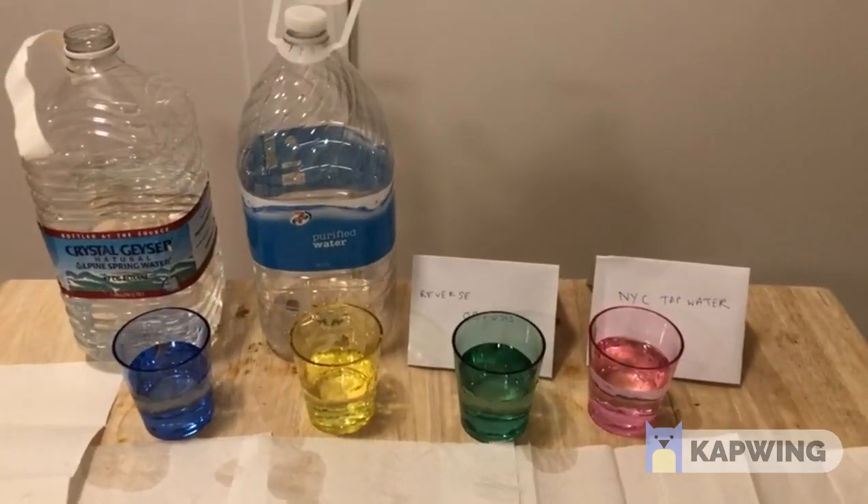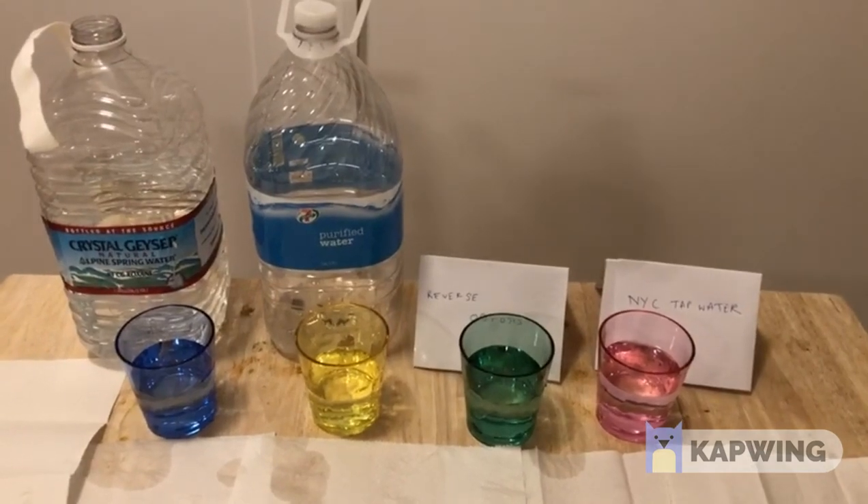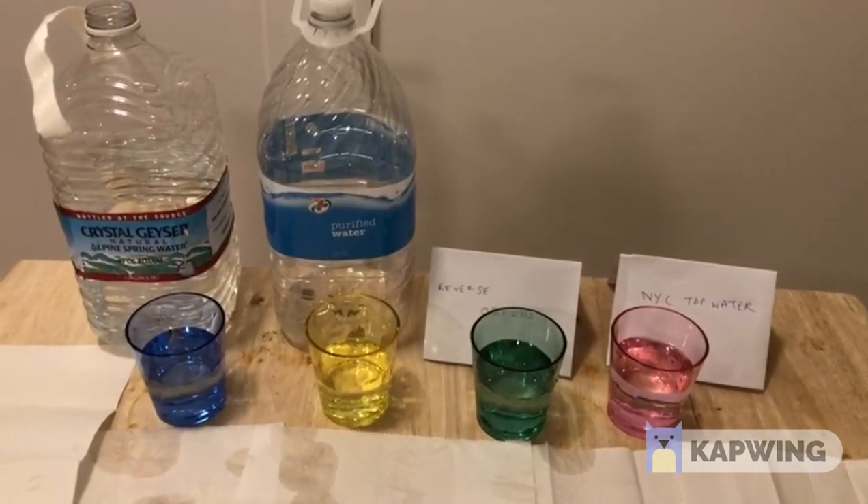Hi everyone. In this experiment we are going to see how pure each kind of water is, and here we have four kinds of water.